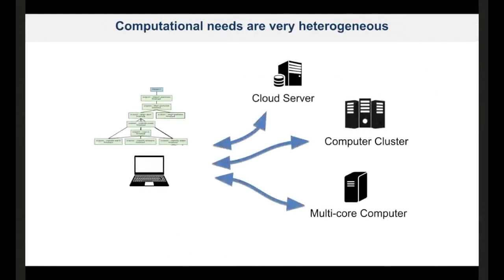And then another important thing that we face in Cryo-EM is that the computational needs are quite heterogeneous. I would say for some steps we need more of a graphical interface or GPU, where there are more graphically oriented jobs, or in some cases we need more computational power with CPU or a big disk for fast I/O. And then moving all this data around is on the shoulders of the user right now. I think it was also a requirement for such a framework to try to automate.